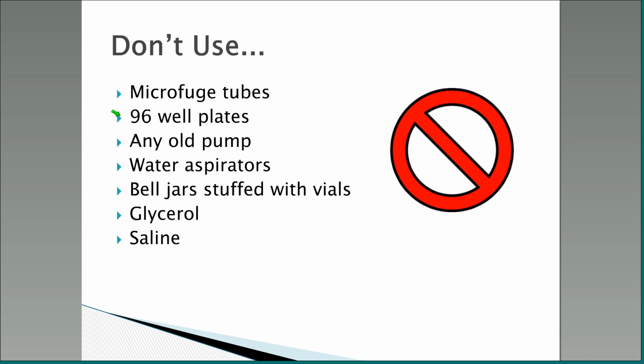And after I did a whole bunch of work, I discovered that once you freeze dry in a 96 well plate, water will diffuse across the plate. One thing you can do, if you do use plastic, which I don't recommend, is put your samples into a seal and meal bag, a Mylar bag, and vacuum seal it after you freeze dry, but you have to work quickly because it will pick up water pretty quickly.